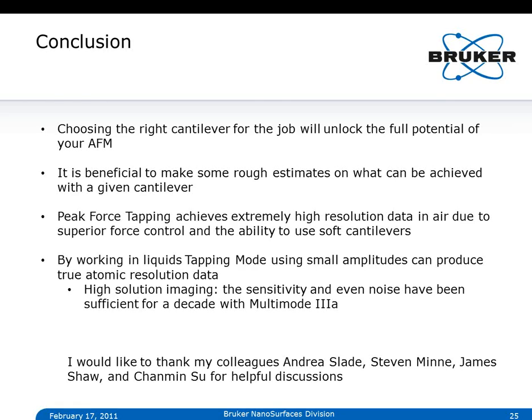Okay, so keeping with the apex, two questions on how do you clean a probe. Does Bruker have a standard procedure to clean tips? Do we need to clean a new tip for best results? And again, how do you clean a probe if something is sticking to it after multiple uses?